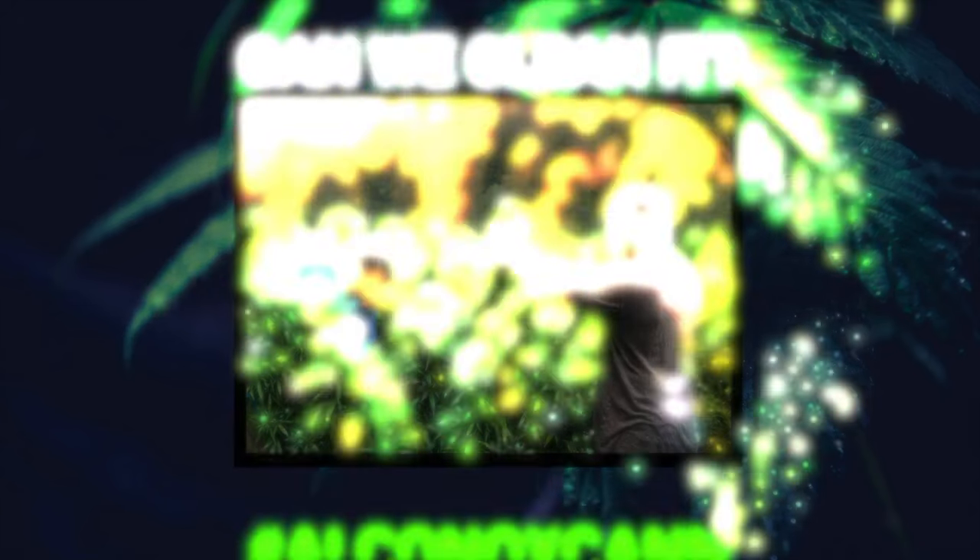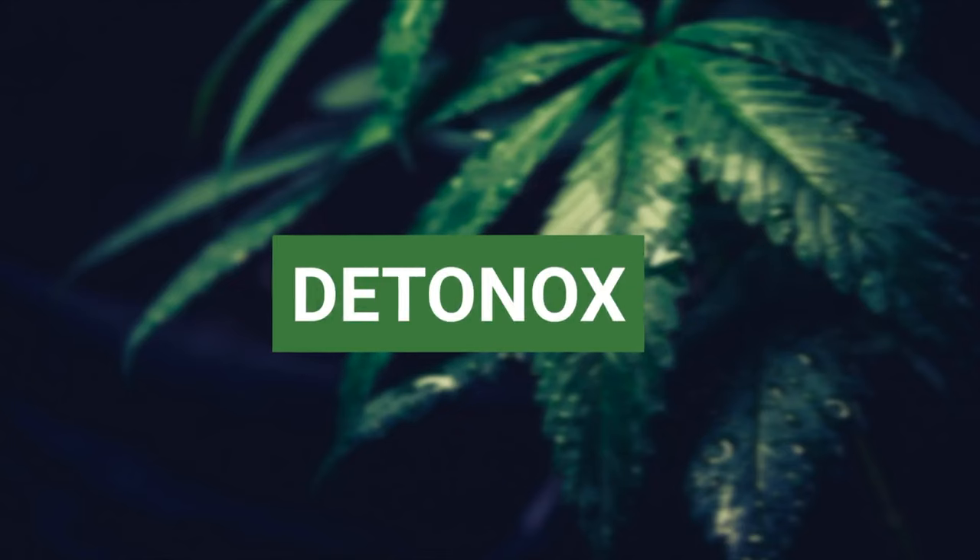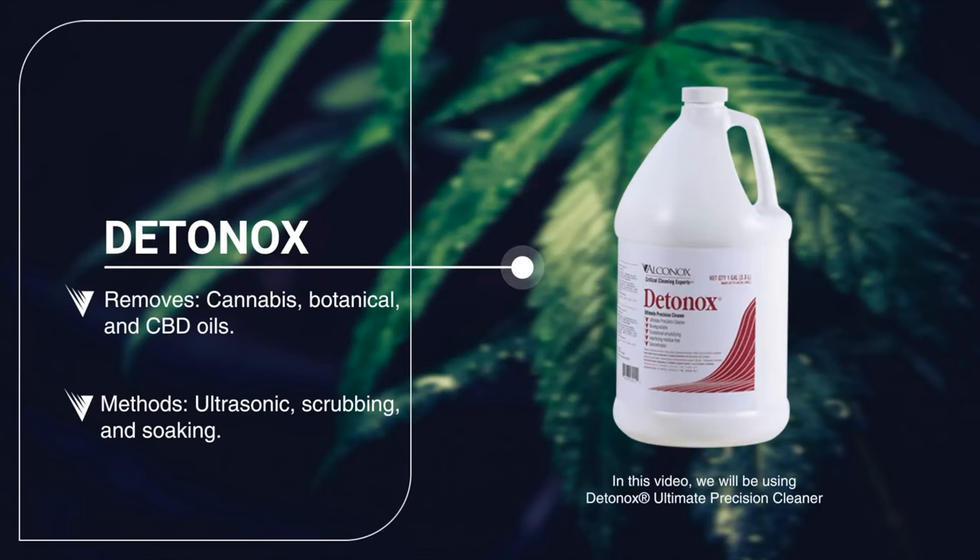Can we clean it? Yes, we can. Designed as a concentrated manual and ultrasonic cleaner, Dedanox detergent was created to remove sticky, difficult organic oils and extracts while leaving no residues behind. With no additives, fragrances, or dyes, this water-based detergent is the perfect solution for removal of cannabis, botanical, and CBD oils.